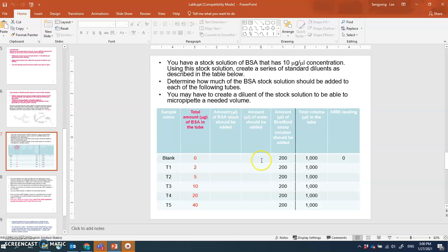You will add a certain amount of water to get about 800 microliters total volume made. Once you have 800 microliters, to each tube you will add 200 microliters of the Bradford dye solution, so the total volume in each tube will be 1000 microliters.